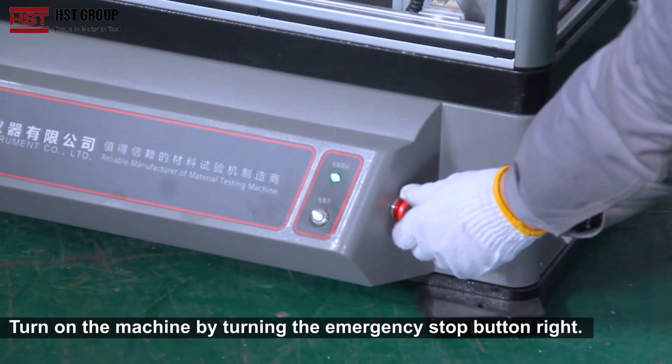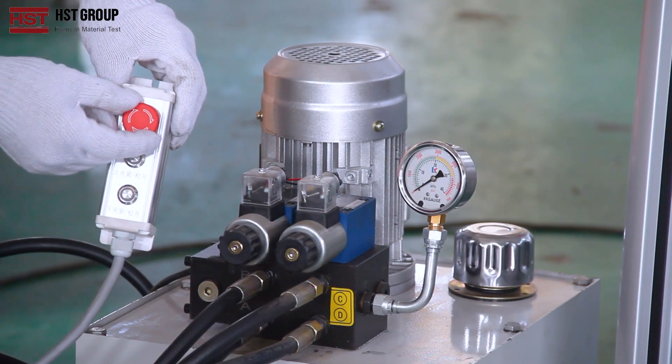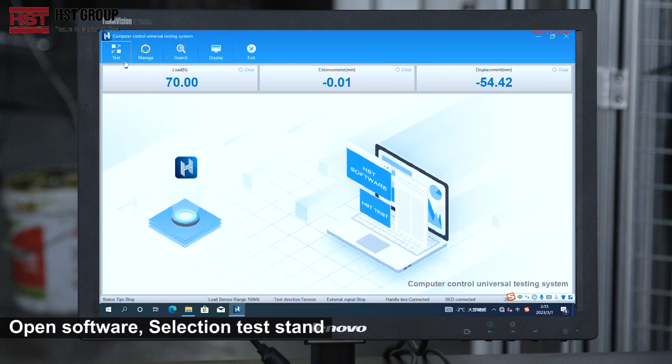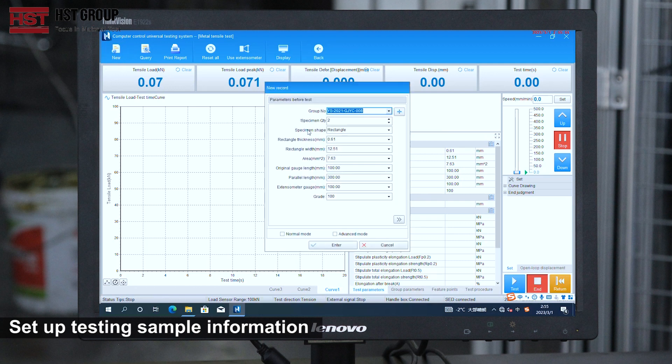Turn on the machine by turning the emergency stop button right. Open the software and select the testing standard. Set up the testing sample information.